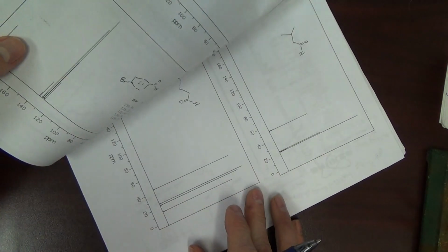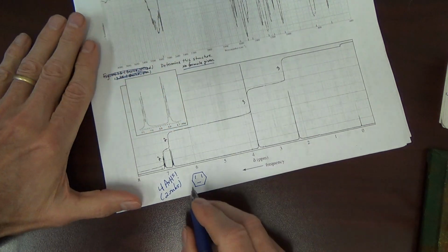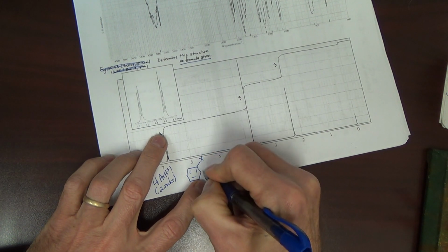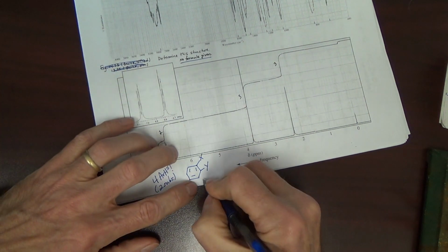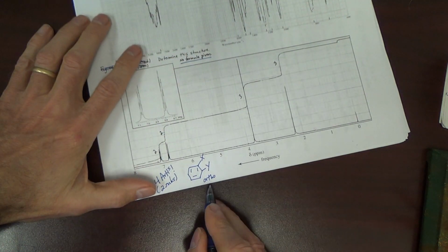And assuming, it depends on how much symmetry. I'll take a look at this assuming no symmetry. 2 substituents are different. They can be next door to each other. That's called ortho. We will learn this terminology during test 2. It's worth learning now.